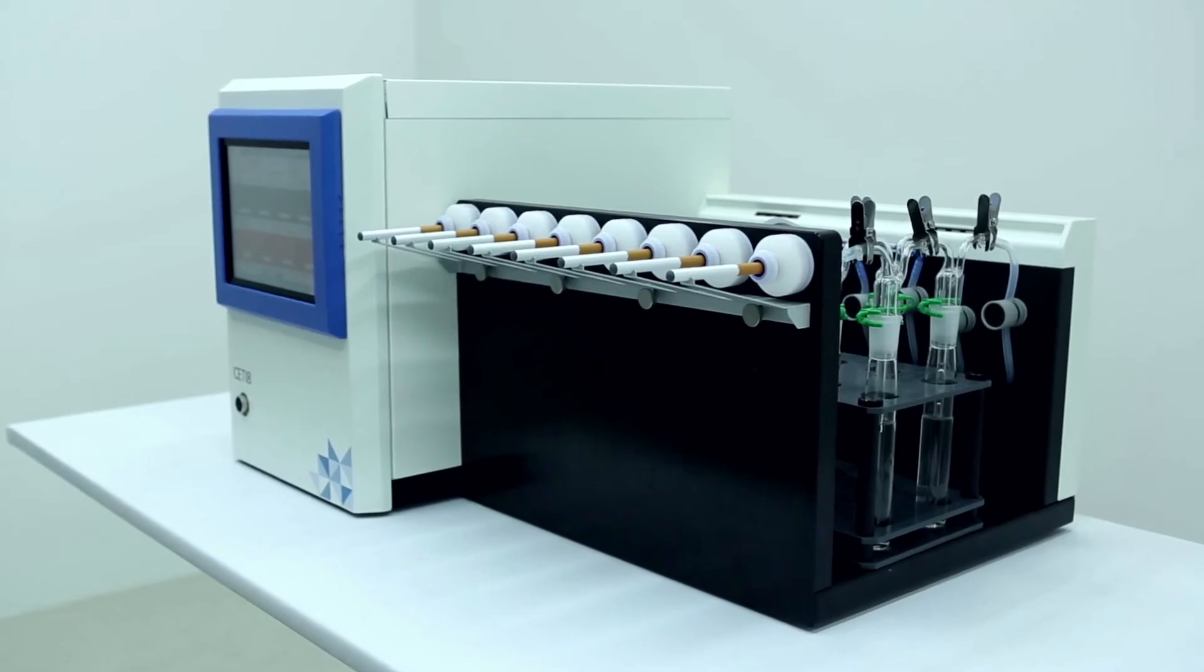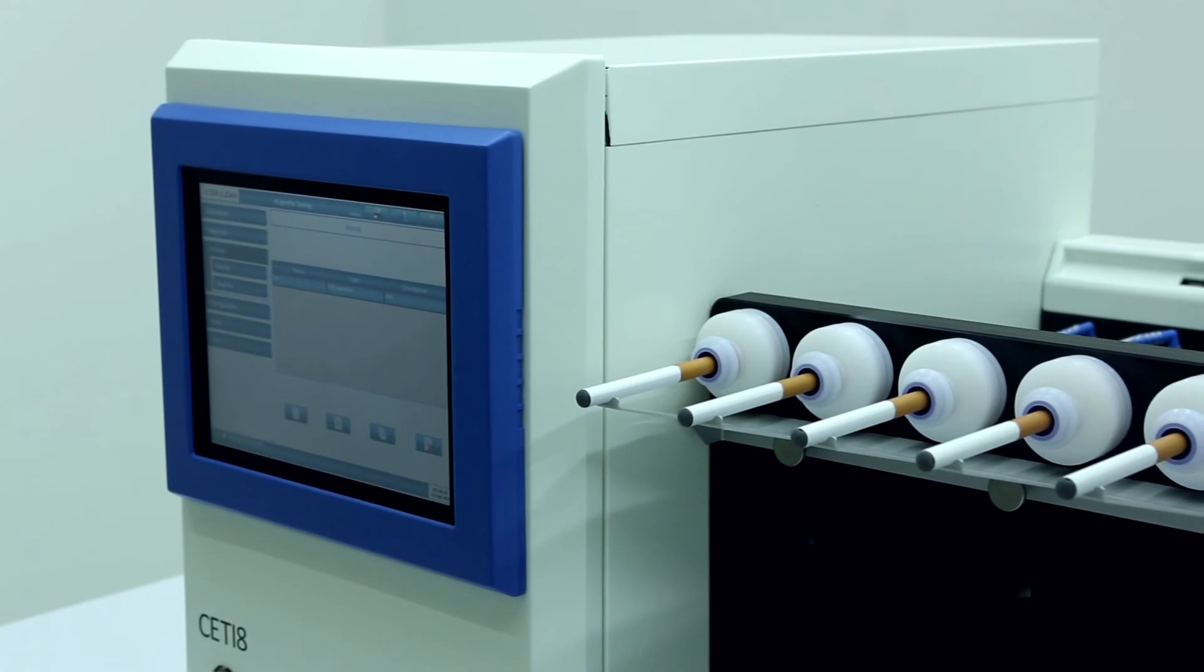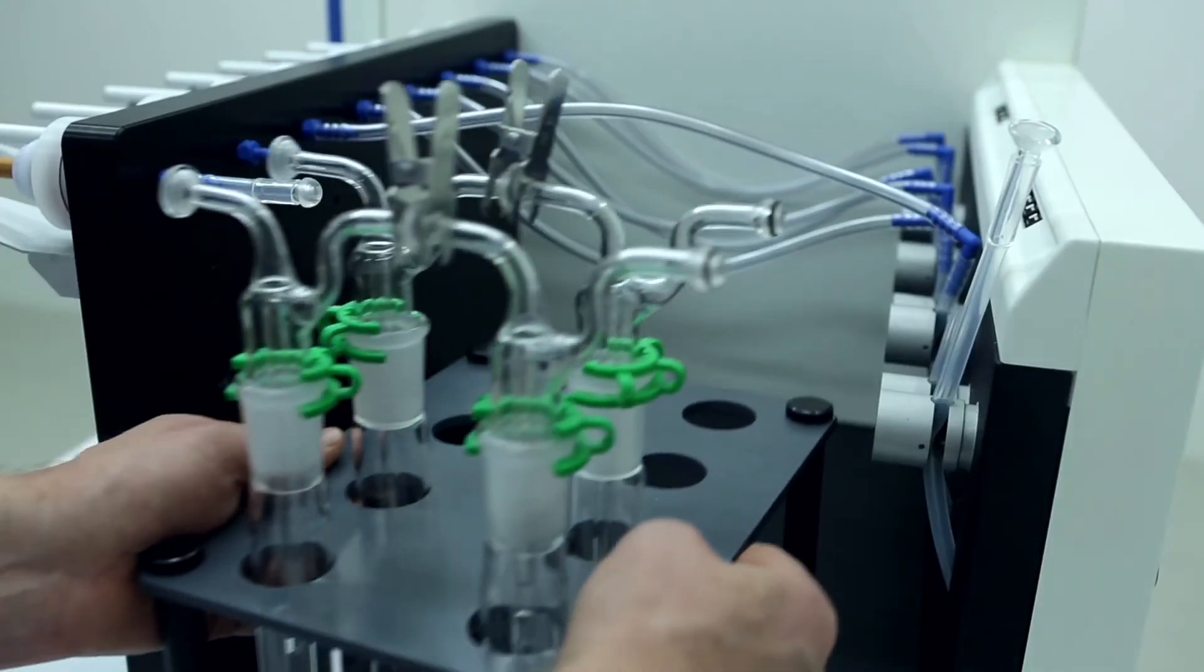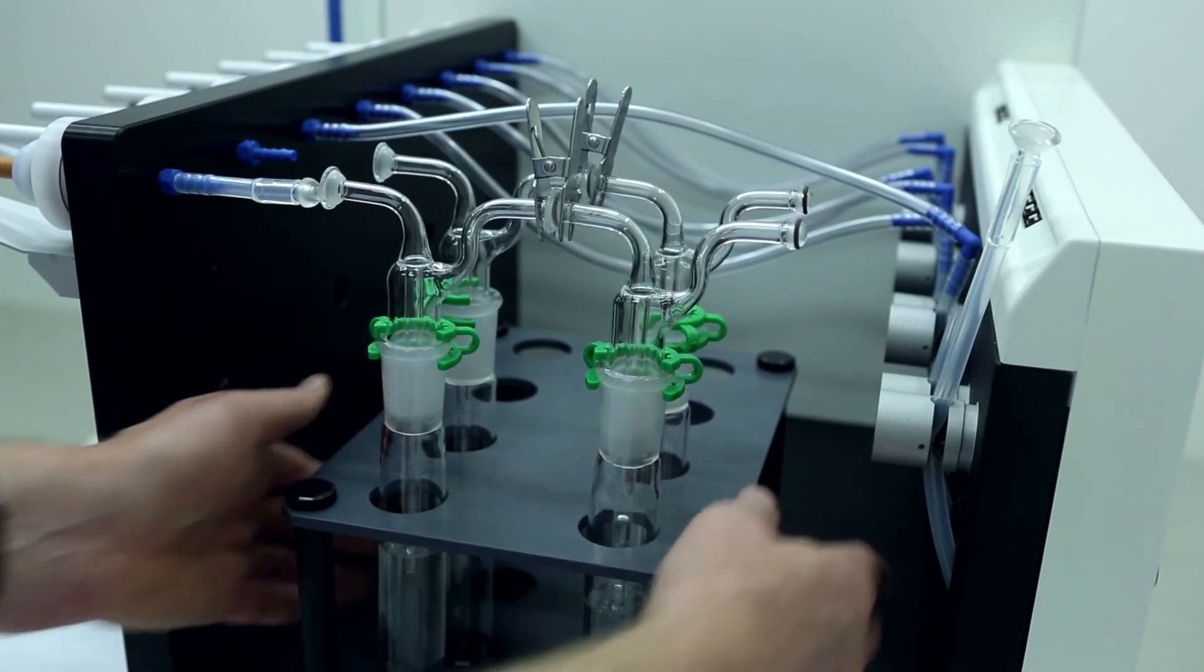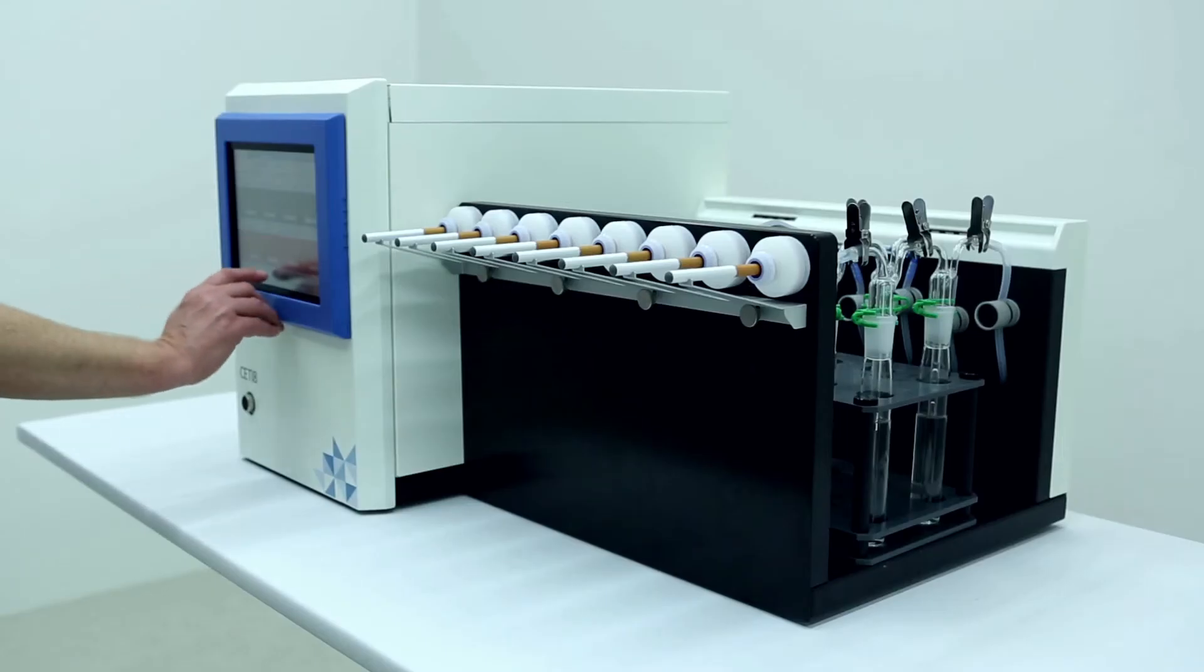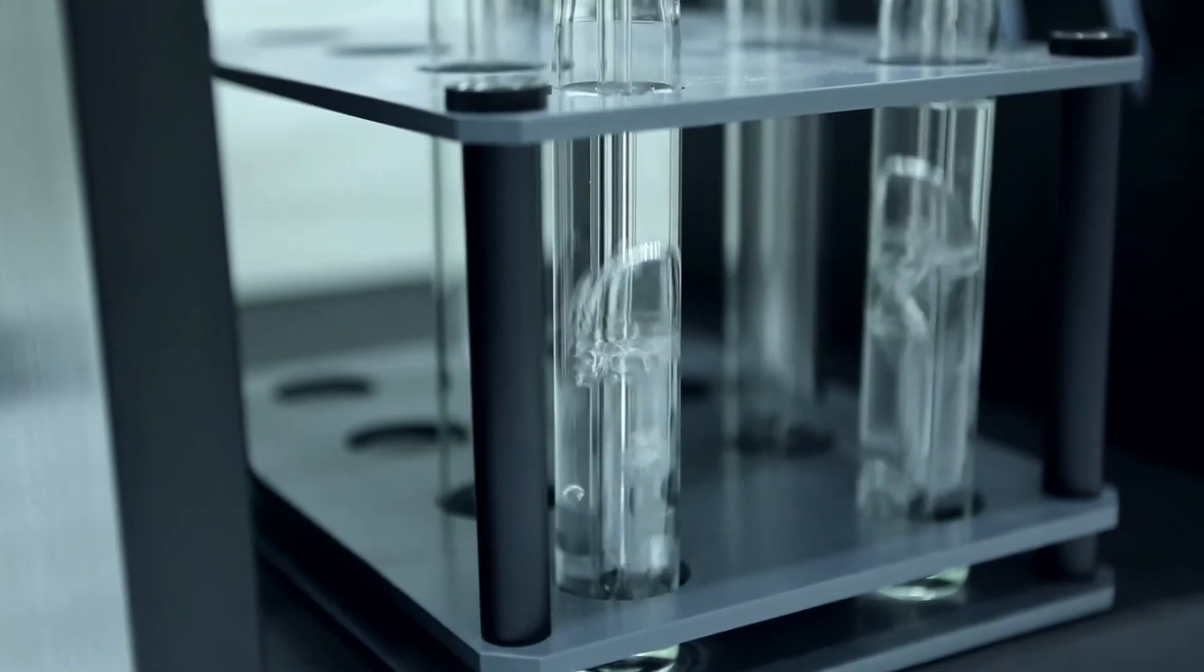The CETI-8 uses traditional 44mm Cambridge filter holders to capture the vapor. Alternatively, the revised CETI-8 allows connectivity to all 8 channels to individual impinger traps for alternative capture methods.